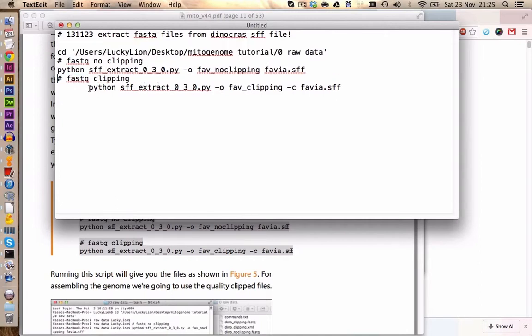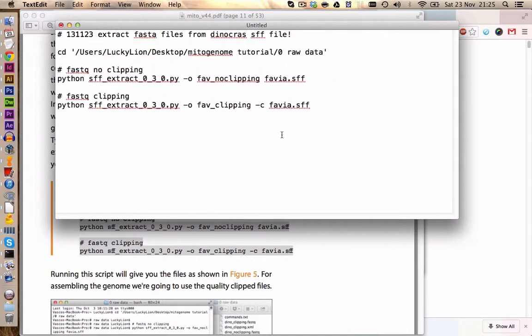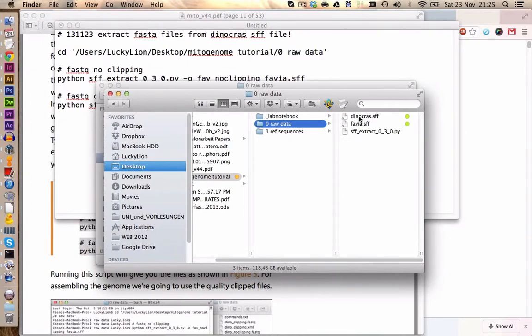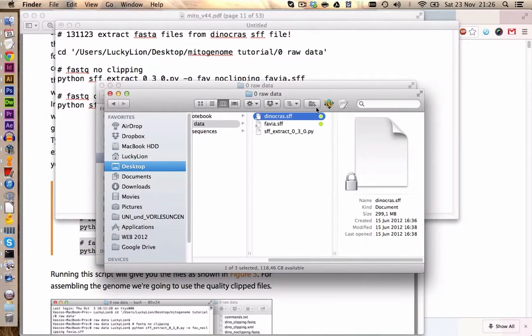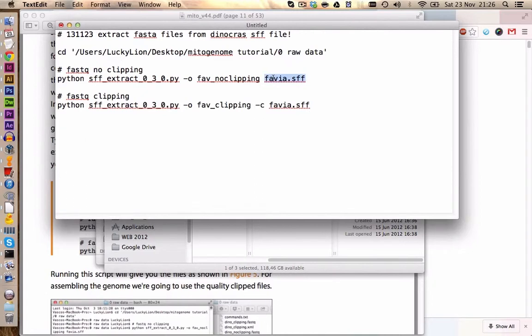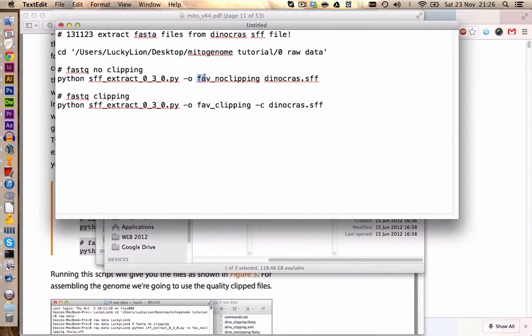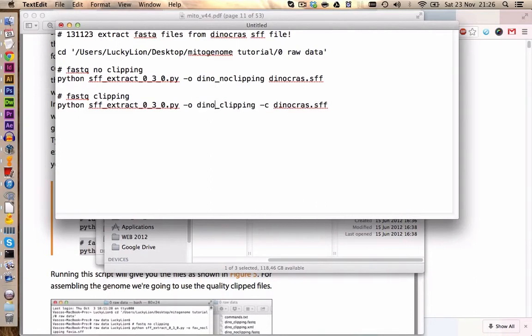We now have to change some things because this example is still for the coral Favia and we want to extract Dinocross. So we go to our Dinocross SFF and you can directly copy the name and we paste it in here. Then of course we also want to change the name of the files we are creating. So this minus O gives the name for the complete output here. So we call this one Dino_NoClipping and Dino_Clipping.